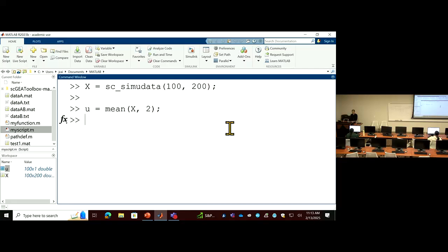If you do the sum of x by columns, this will be the library size. By definition, it is how many reads appeared in one cell. Cells are in the columns, so we just sum the total. That's the library size, basically.